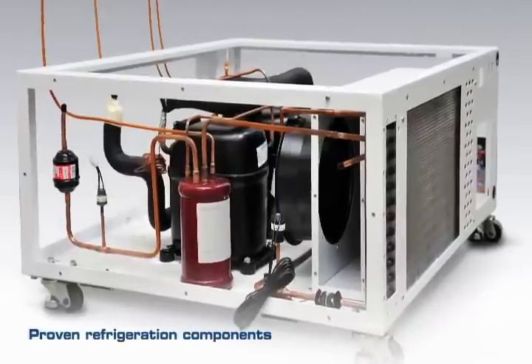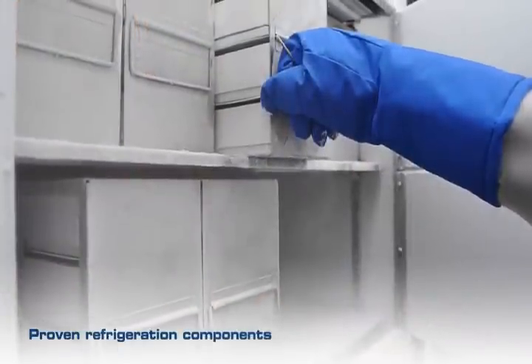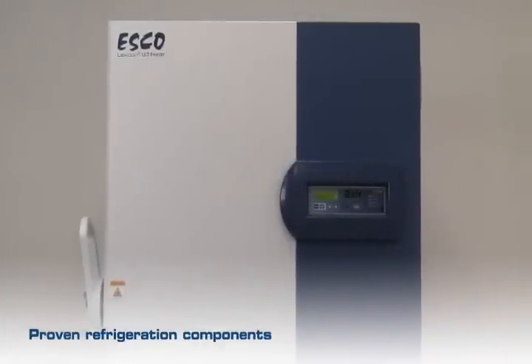Proven refrigeration components including high-performance compressors and oversized condenser provide a larger area for cooling. Condenser fans generate high airflow whilst achieving quiet operation.